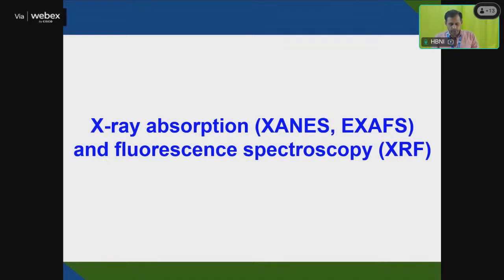In the X-ray absorption technique, there are two parts: one is X-ray absorption near edge structure, and the other is extended X-ray absorption fine structure. So XANES and EXAFS, these two techniques are in the case of X-ray absorption spectroscopy.